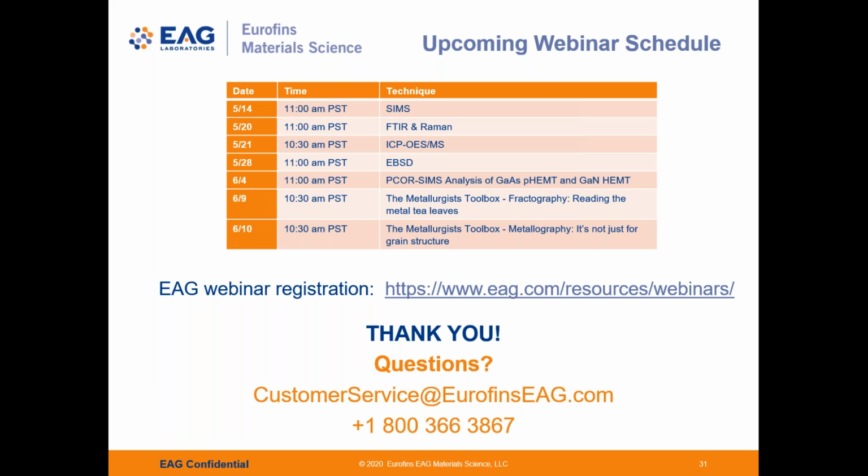Okay. So what is the minimum detection limit for hydrogen in HFS? Well, it's very good. The detection limit is something like 0.1 or 0.2 atomic percent. It's quite sensitive, yes.